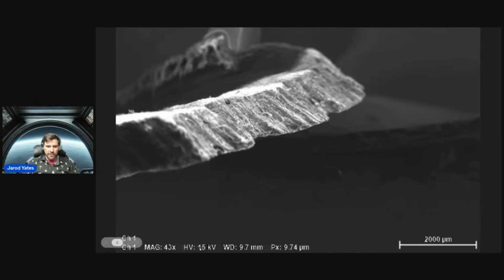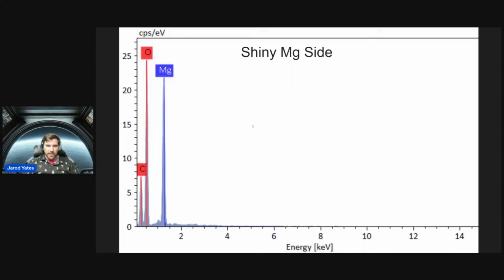For reference, as we're looking at these SEM pictures, this kV down here is the brightness that you're dealing with. We're dealing with somewhere between 5 kV to 30 kV for our brightness in all of these pictures. So this is about mid brightness here. And over on the side, you'll see size scale in microns for most of this stuff. Here is the elemental composition of that image I just showed you.